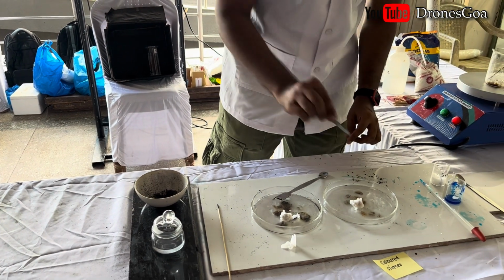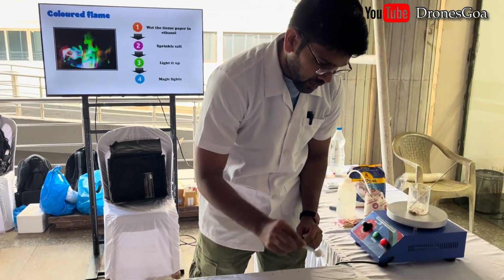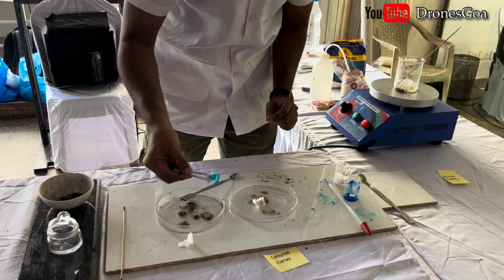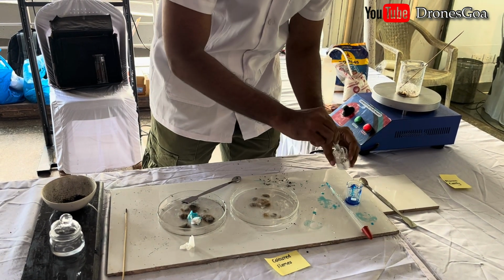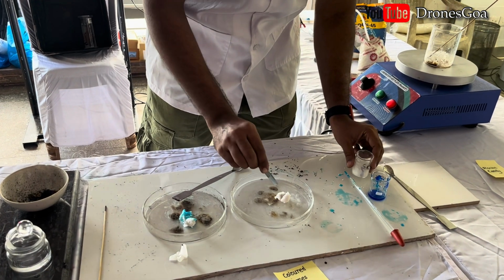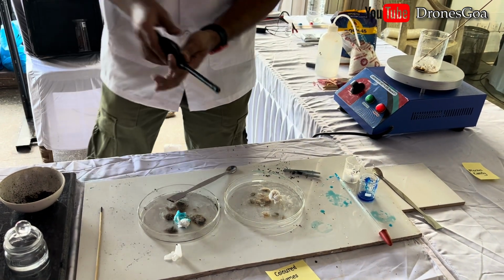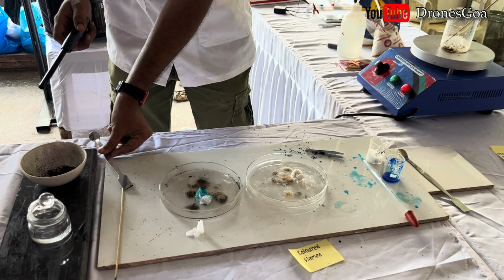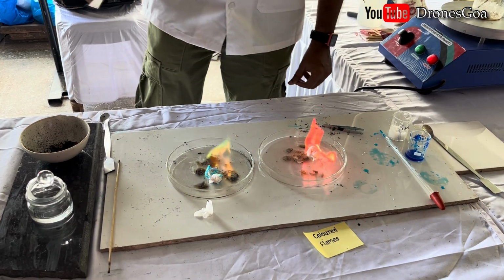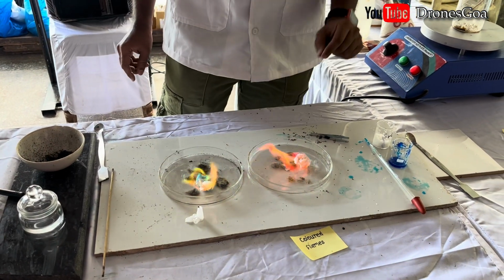So I have two pieces of tissue paper dipped in alcohol. I'll put some salt onto it. This is a blue color salt which I have, and similarly a colorless salt. I'll tell you what these salts are, and we'll put it on flame and see different colors. So let me first light the blue salt, which gives the green flame, and that was a white salt which gave you the crimson red color flame.